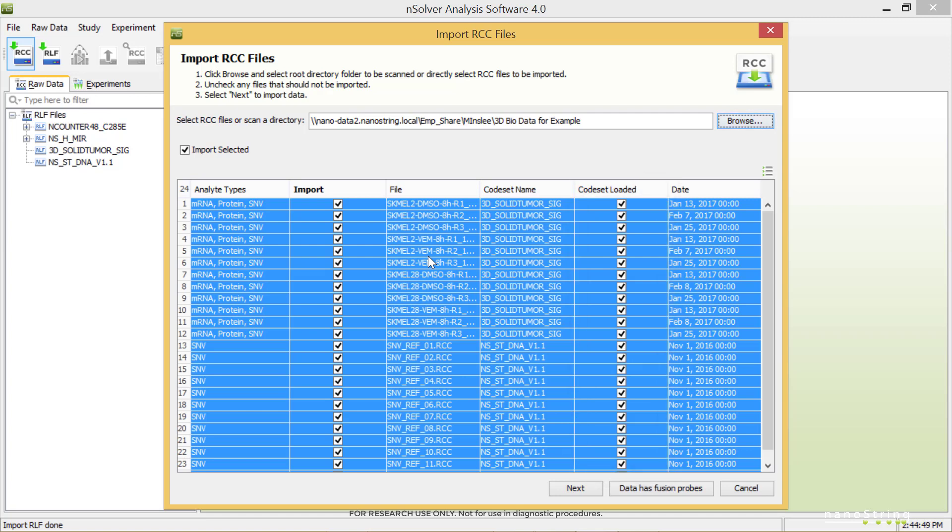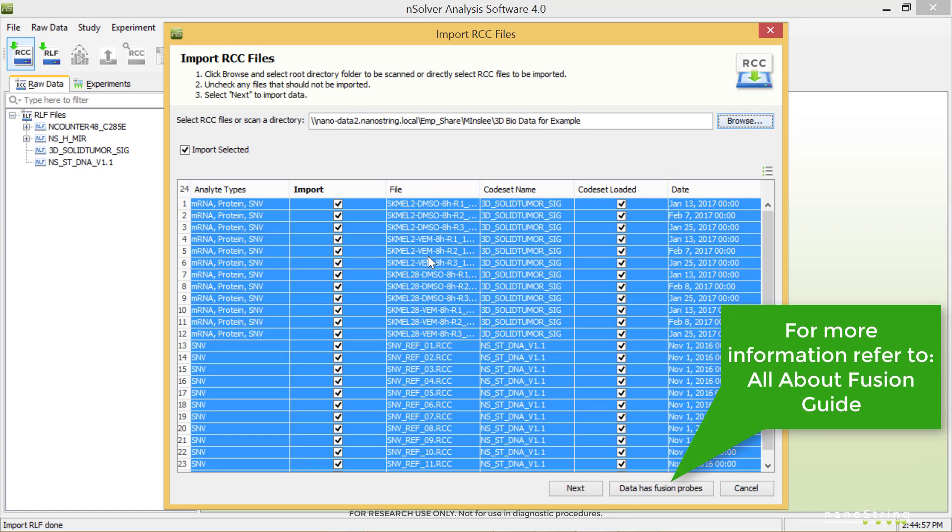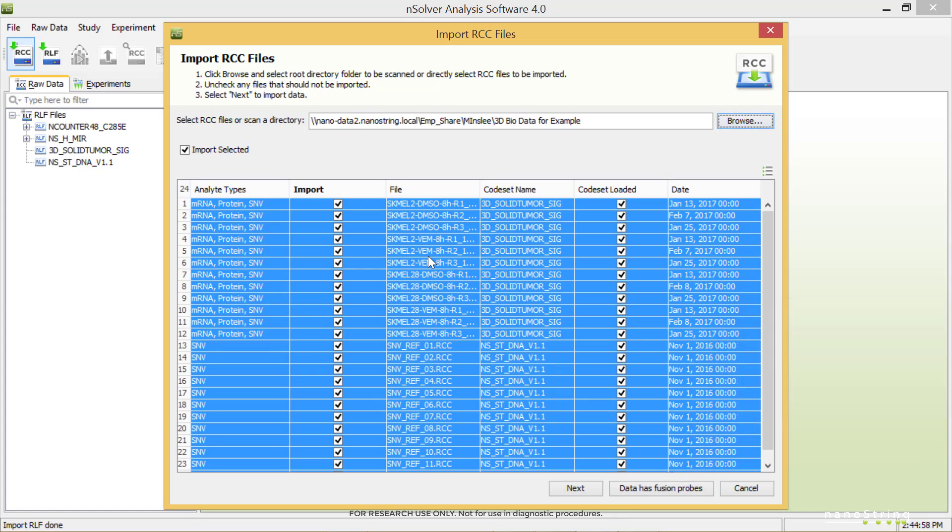If your data has fusion data, select the Data Has Fusion Probes button to designate fusion probes in your code set. Otherwise, all of these probes will be treated as mRNA probes. For more information on fusion analysis, refer to the NSOLVER 4.0 Manual or the All About Fusion Guide. Select Next.